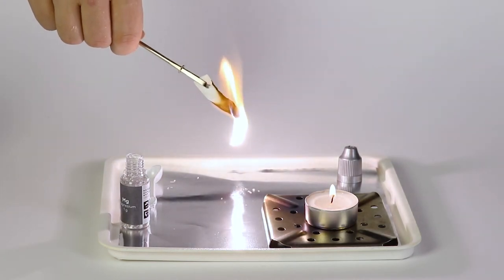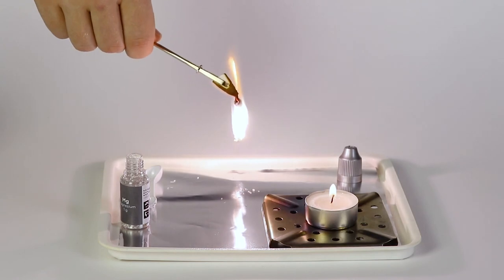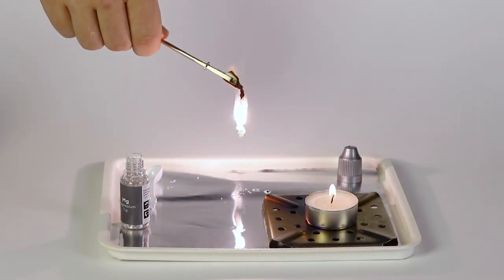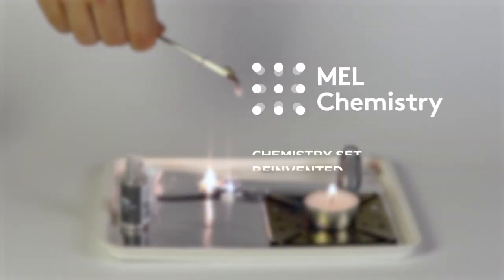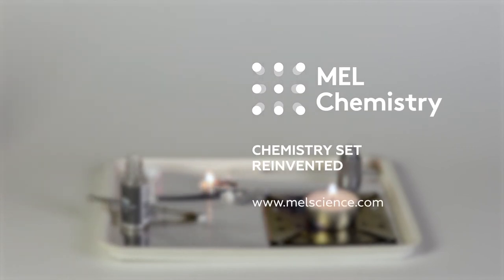Let magnesium burn out completely before disposing of it. Learn more about this experiment on our MELScience website.